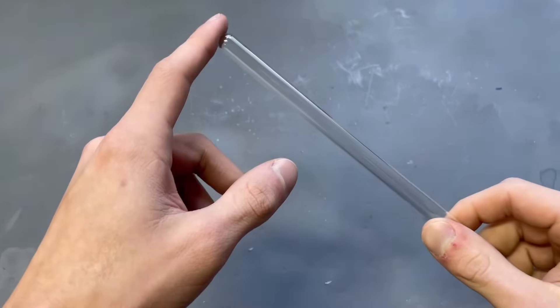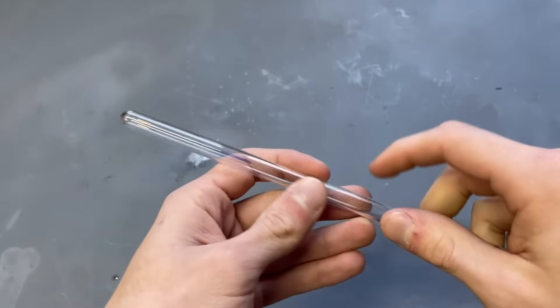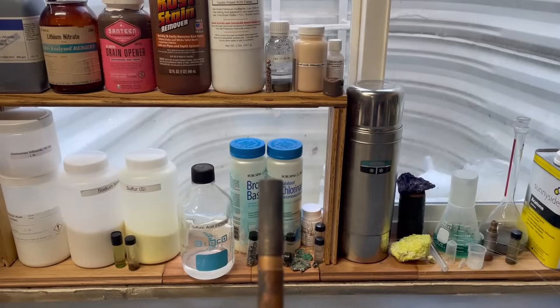This rotation technique is very important for the next thing we'll do. We'll actually be forming one of these rounded tips, which involves spinning while adding air into the tube so it expands. Let's light the torch and get going.